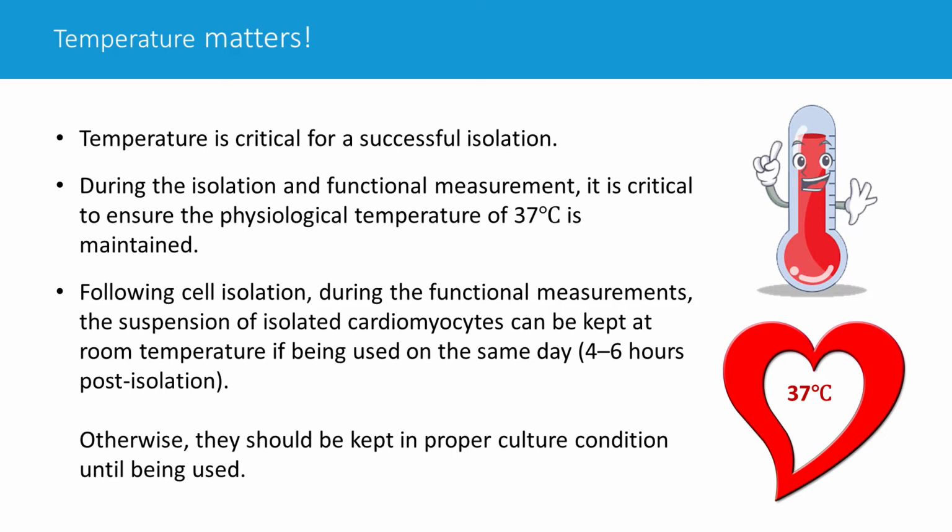So, for example, if you're measuring sodium currents using patch clamp, then I suspect that the influence of temperature is not as great. Therefore, you'll see that a lot of sodium measurements are done at room temperature. If you're doing sodium potassium pump measurements, then that's an ATPase, and that's highly sensitive to temperature. So the function of the sodium potassium pump would be incredibly responsive to changes in temperature. Therefore, whenever we did sodium pump measurements, we would always make sure that we're working at 37 degrees.